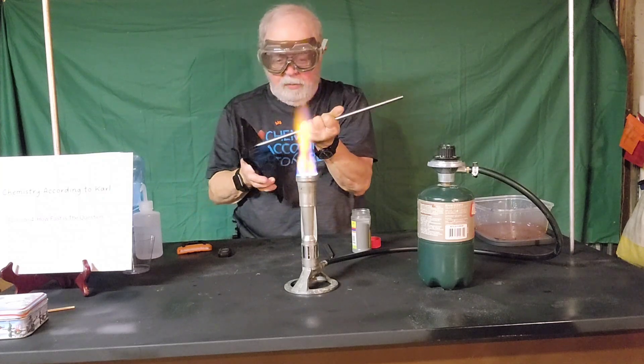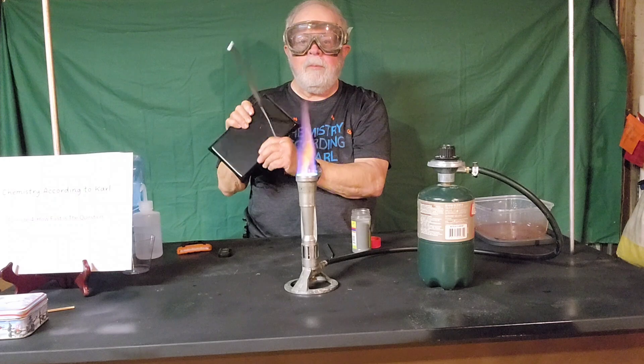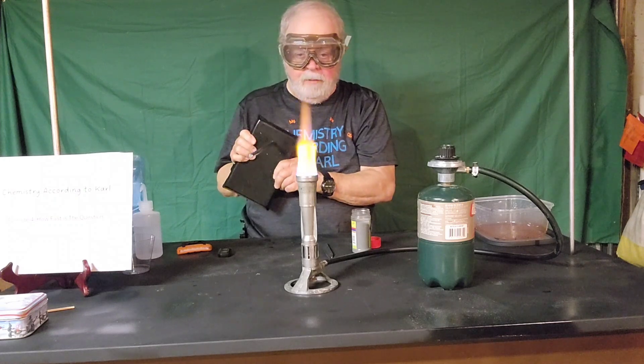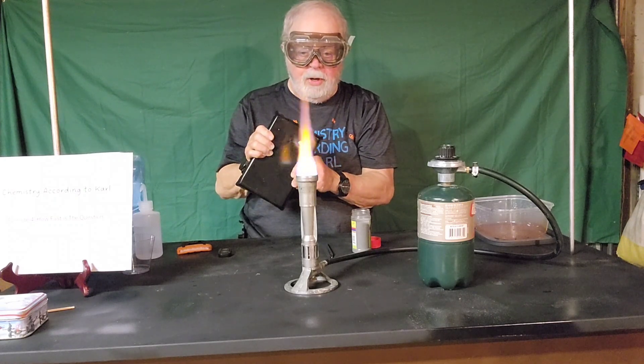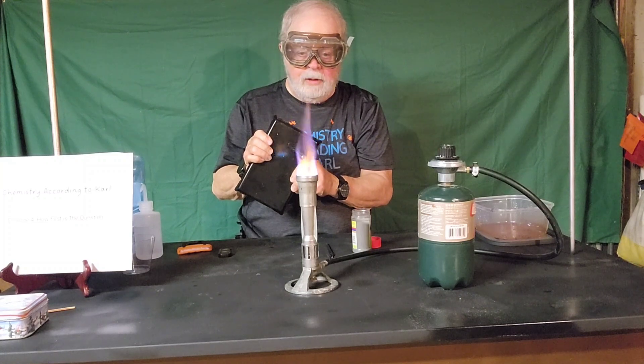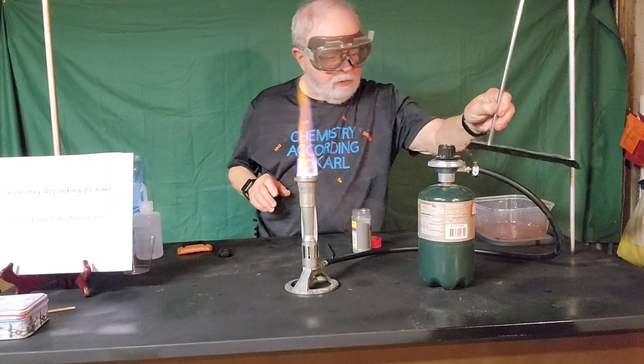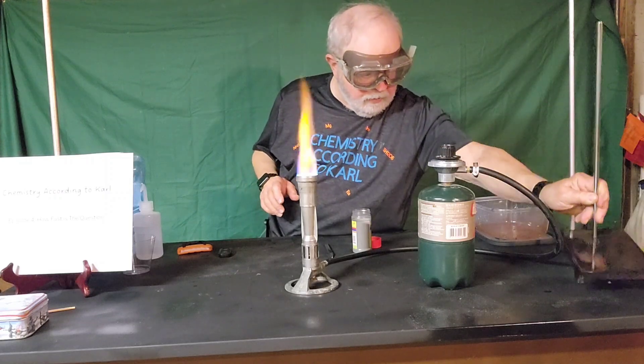I have a Fischer burner flame going here, and a big piece of iron. I'm going to put it in here and see if we see much of a reaction. And no, we don't — not much of a reaction at all. It just heats up a little bit.